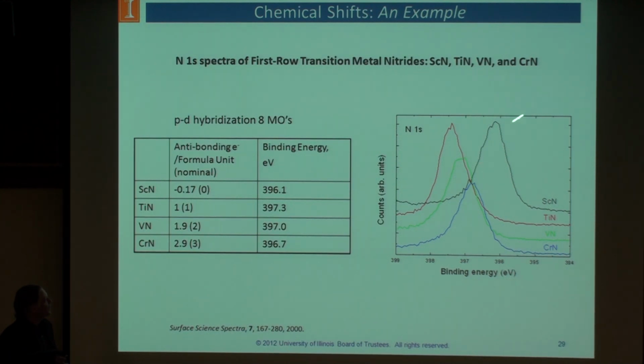and that affects the electronic structure of our nitride. You'll see that the scandium nitride has the lowest binding energy. That indicates that it has the most ionic bonding. So we've seen some charge separation that gives evidence that there is a band gap in this material. With this data and some other data, we're able to demonstrate that scandium nitride is a wide band gap semiconductor. Then you'll note that the titanium nitride has the highest binding energy, which indicates that this nitride has the highest degree of covalent bonding. Then the other nitrides, as you would expect as we add in the antibonding electrons, fall in between. The tendency is now toward lower binding energies, which also suggests the introduction of charge separation or the development of another band gap as we go heavier.